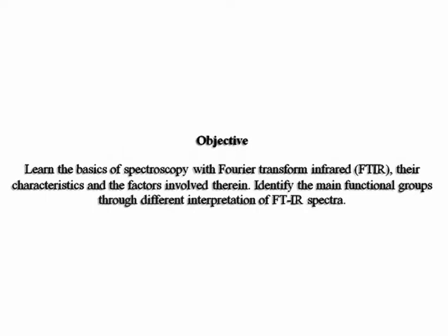Objective: learn the basics of spectroscopy with Fourier transform infrared, their characteristics and the factors involved therein. Identify the main functional groups through different interpretation of the FTIR spectrum.